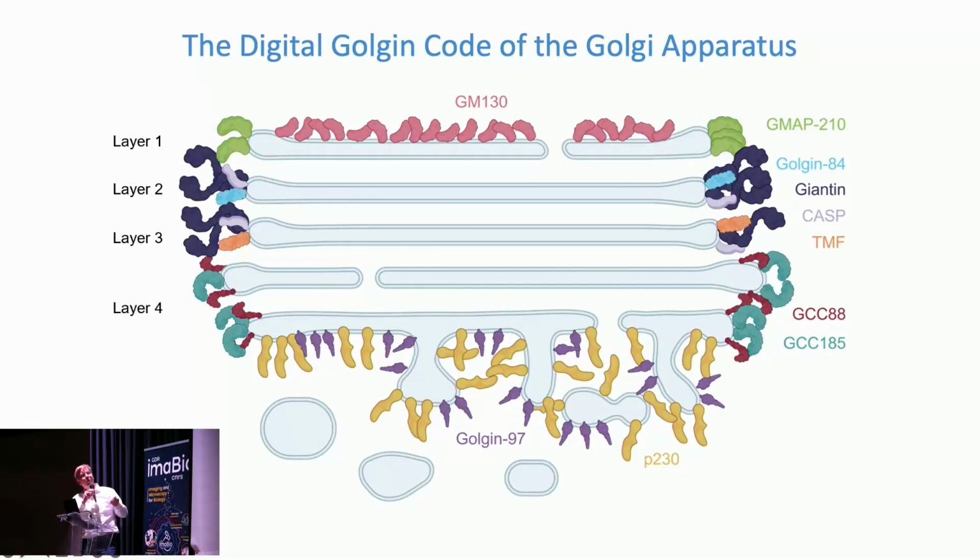Some of them are localized in 2 cisterna, or on 2 layers, while others are clearly defined to just one of them. And Mauan has now validated this further by knocking out a few of them. And for example, you get rid of 1 layer, etc., etc. So what I didn't talk about so far is multicolor imaging, right?